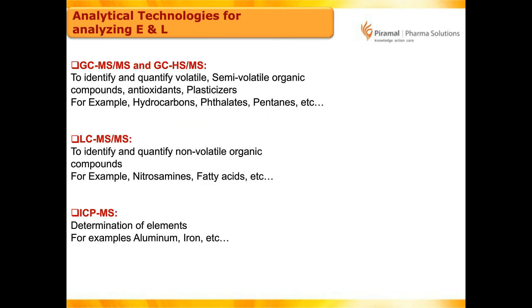Coming to slide 18, as I mentioned earlier during my discussion, you need to be very careful in selecting the analytical technique, because nowadays the requirements from regulatory bodies are at ppb level. Gone are the days when people used to report in ppm. So you need a technique where sensitivity plays a very important role.